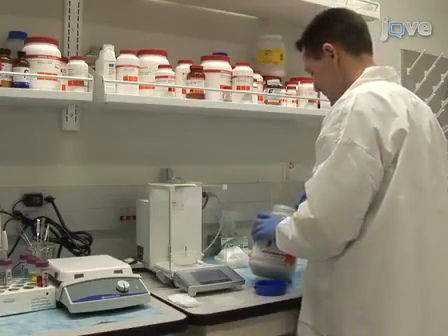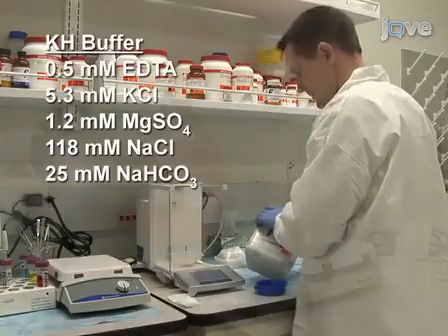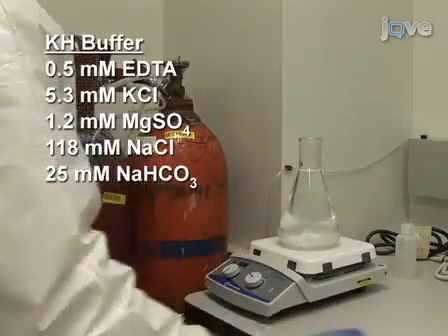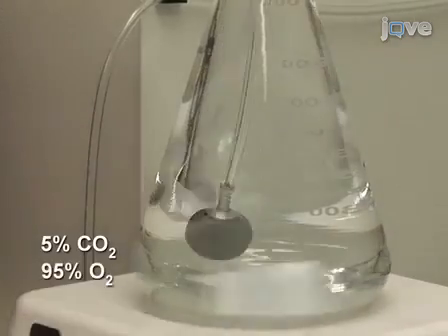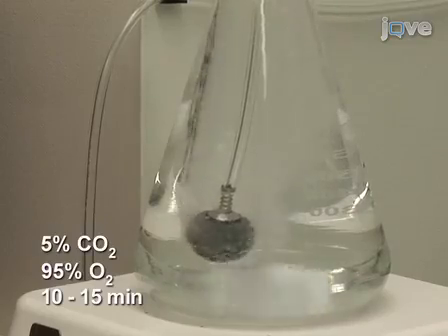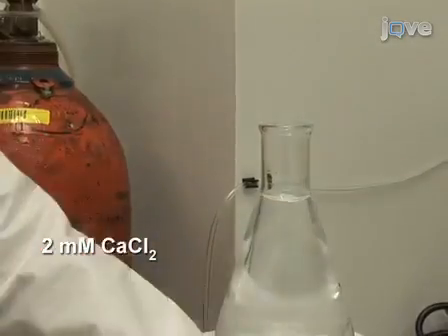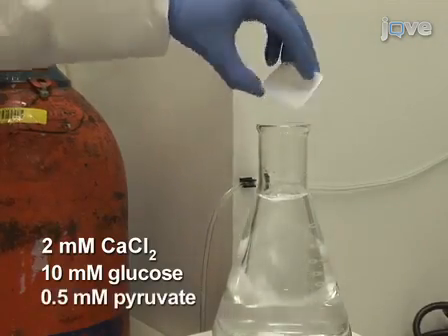To begin this protocol, prepare one litre of Krebs-Henseleit, or KH, buffer. Introduce 5% carbon dioxide and 95% oxygen bubbles into the mixture for 10 to 15 minutes. Then add 2 millimolar calcium chloride, followed by substrates: 10 millimolar glucose and 0.5 millimolar pyruvate.